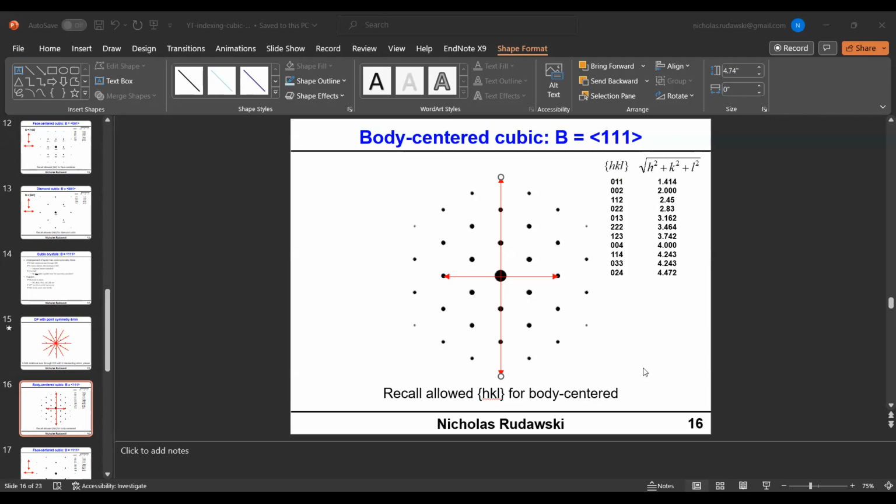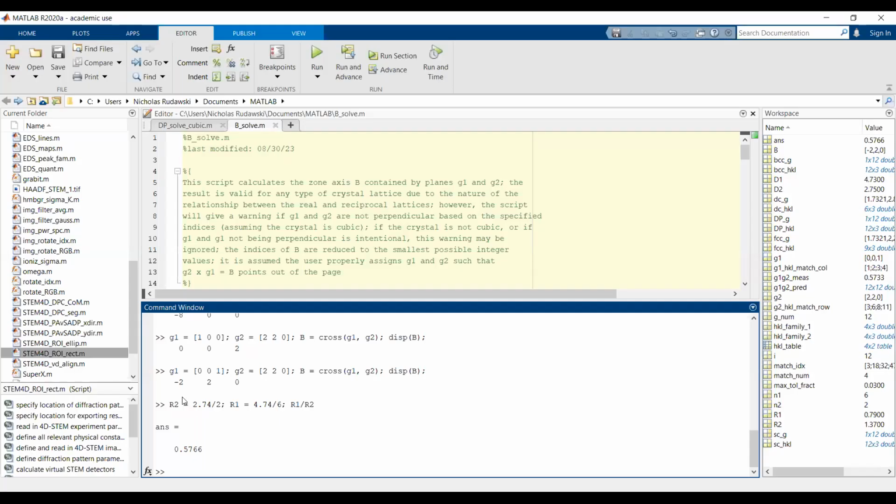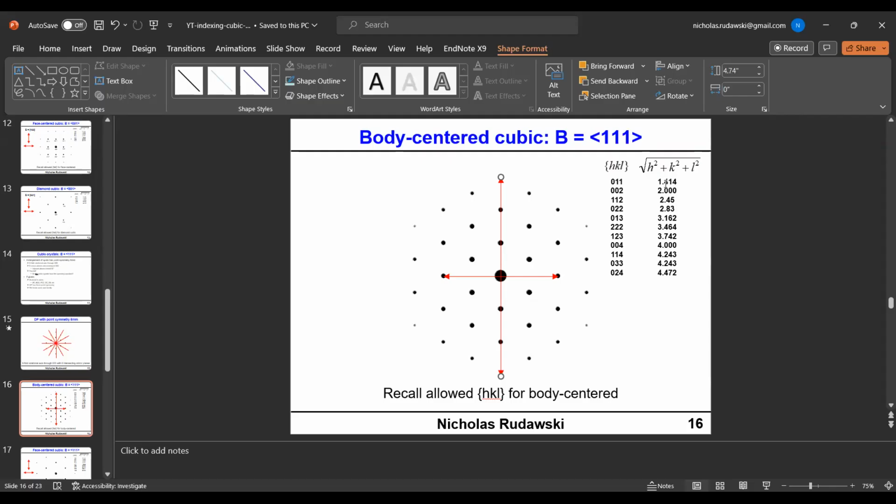Okay, we can round it up to 0.577. Hold on a second here. Okay, no, my bad.